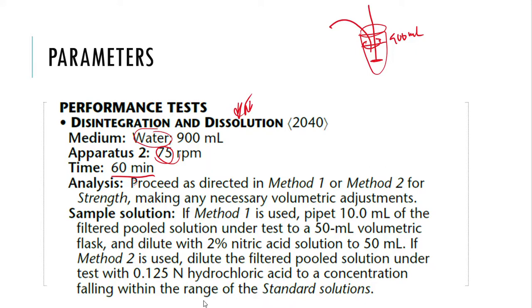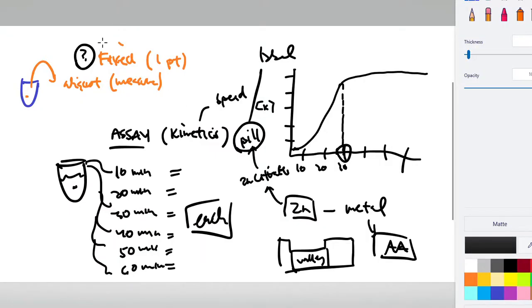Now, what do I do with it after this? Right? That's going to be another question. Now that I've gone through dissolution and disintegration, what do I do now that this pill has broken up and I need to analyze it? Okay, well, here's what will happen, or here is what goes on.